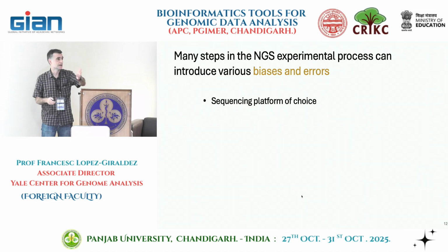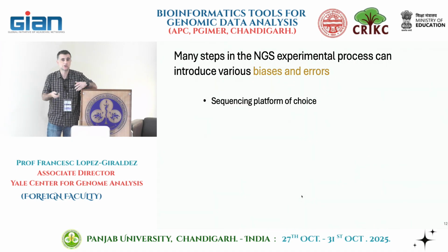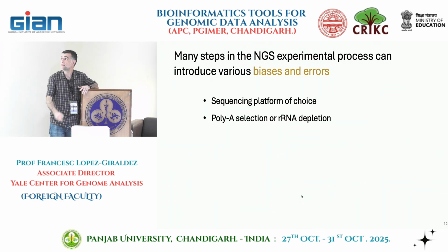In bulk RNA-seq, currently Illumina is the platform of choice. You only need short fragments. You don't need to worry about long fragments. But if you want to capture the whole transcript, you're probably going to need to move to PacBio, which is going to give you a full transcript. For bulk RNA-seq, Illumina is normally the choice. It's what we currently use, the short read technology. But you need to make a choice, or use whatever is available to you.